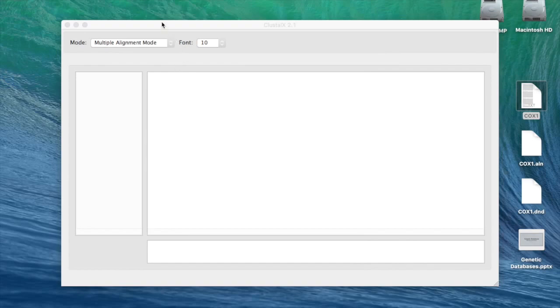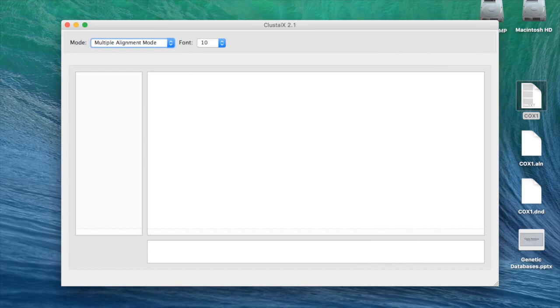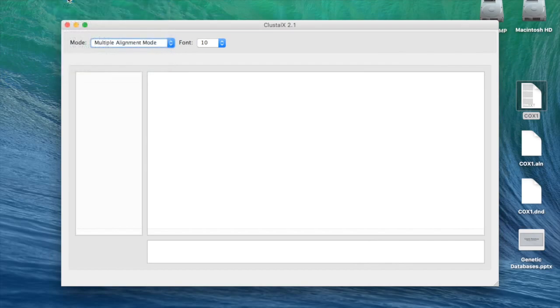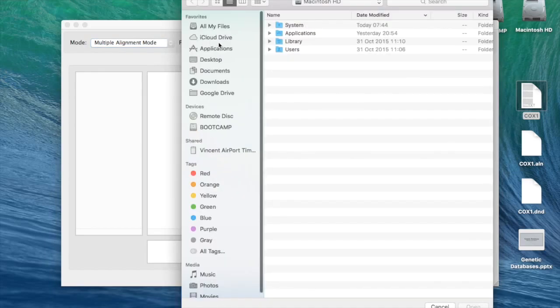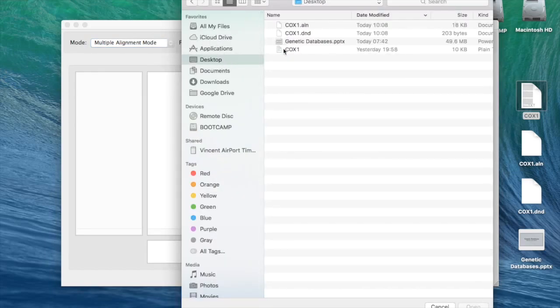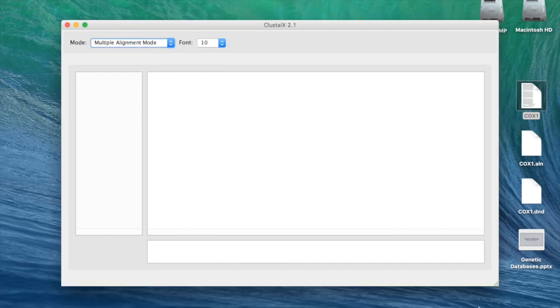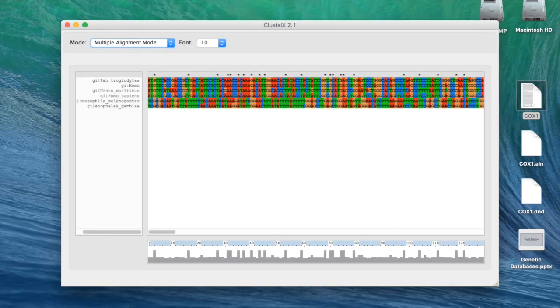So in ClustalX, now it's open, I'm going to go to the menu at the top, and under File, I'm going to click Load Sequences. And then I can navigate to my COX1 file that's on my desktop, and I'm going to just click open. And then we have some sequences here.